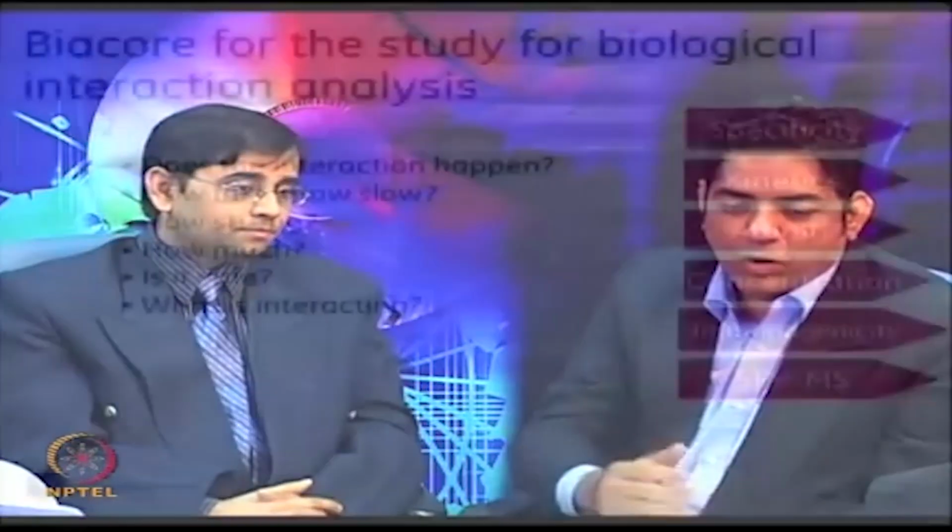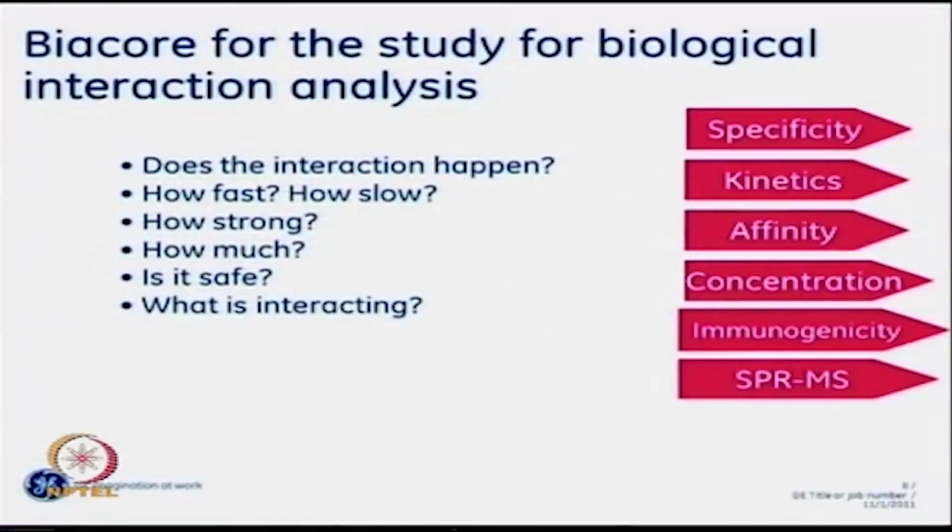Yes. So, here I have on my PPT a very simple analysis of different things that can be done with Biacore. So when someone asks me what can be done with Biacore, these are the 6 things that can be done with Biacore. So very shortly put, these are the 6 applications of Biacore. Whenever A plus B forms AB, when you're studying an interaction A plus B gives AB, the first question you ask is, does the interaction happen or not? Which means, is the molecule AB formed or not?